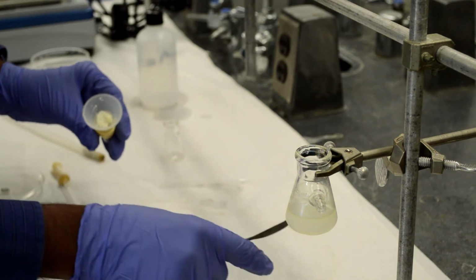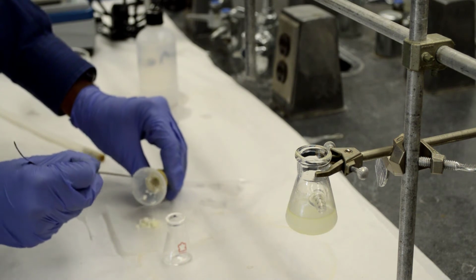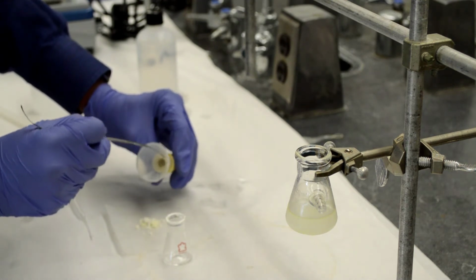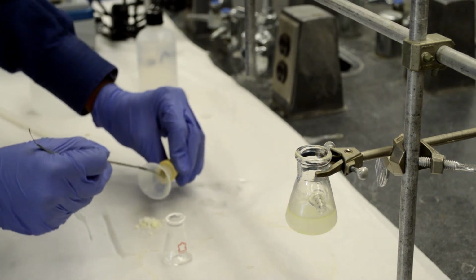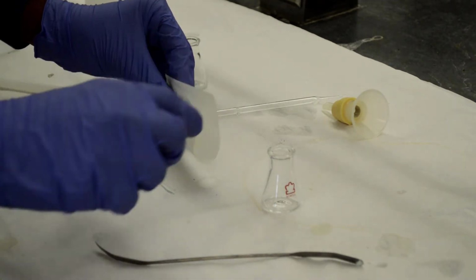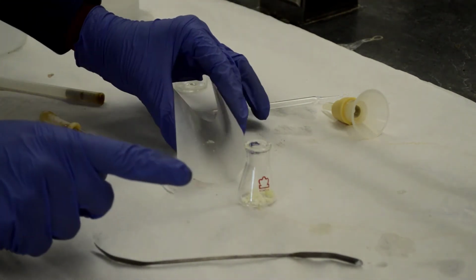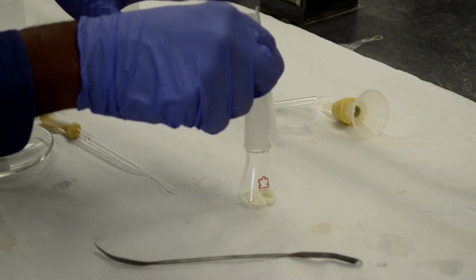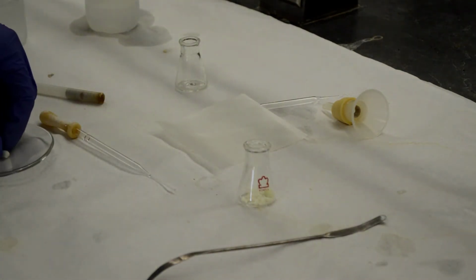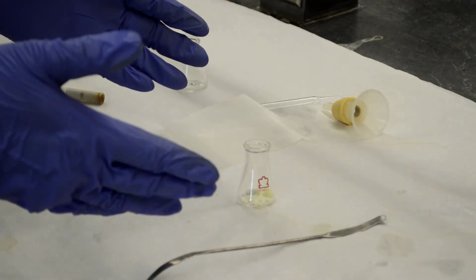Let's transfer these crystals into a small Erlenmeyer flask for a recrystallization step. Try to extract as much product as possible from the funnel and transfer it to the flask. Now add a stir bar into this, and we're going to add a solvent. This is a recrystallization step. You might have studied this in OChem 1.